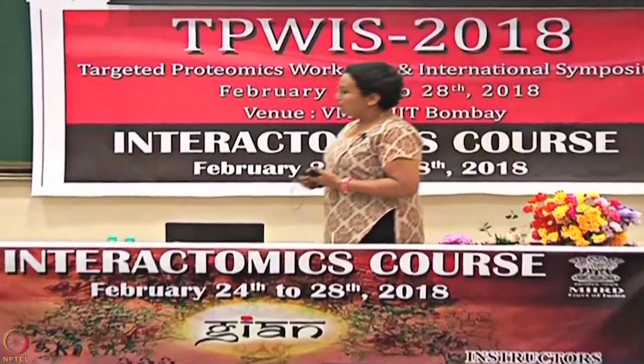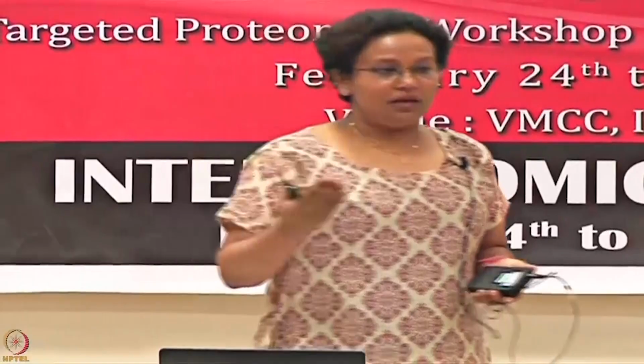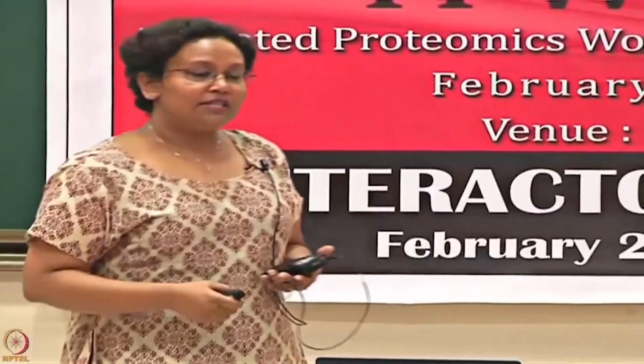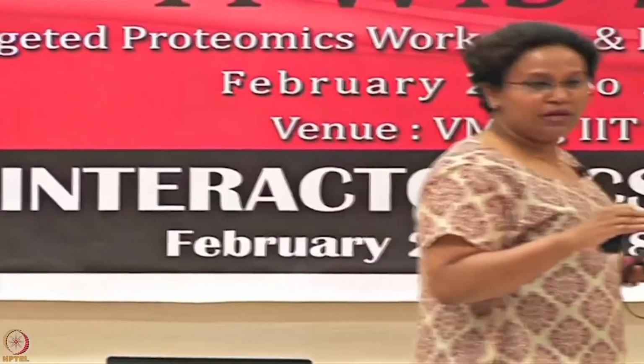The logic here is that when you are already attracting so much at pH 5.5, lowering the pH even further and attracting more does not really help for covalent linkage. That is where you start getting steric hindrance, and your covalent linkage is again not happening in an ideal scenario. So the key thing is to have your proteins in a comfortable environment, close to where your proteins will be comfortable, not stress them out in harsher conditions.